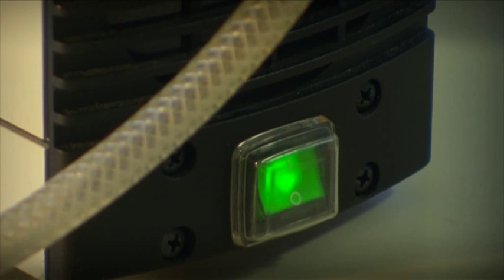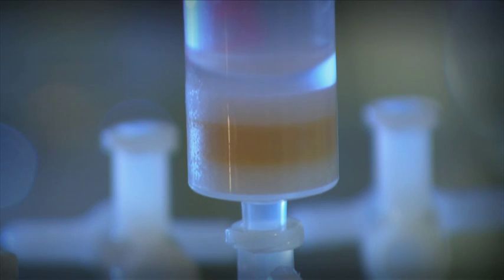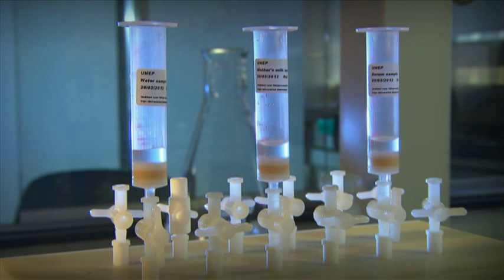After the samples sunk in the SPE column, we'll wash the cartridges with a solution of 4 millilitres of sodium acetate pH4 for the water samples, 2 millilitres of a solution of sodium acetate pH4, followed by 2 millilitres of a solution of 40% methanol in water for the milk samples, and 2 millilitres of a solution of 40% methanol in water for the serum samples. Next, we dry the cartridge by switching on the vacuum pump, without adding any solvents.